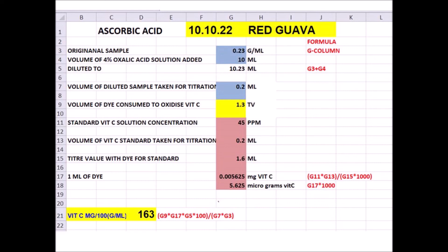Using this dye factor we calculate vitamin C in our sample. In row 18, we convert the value into micrograms by multiplying G17 by 1000, since 1 mg equals 1000 micrograms. In the G column you must type the equals sign before the formula expression G17 × 1000 to execute the program and obtain the numeric result.